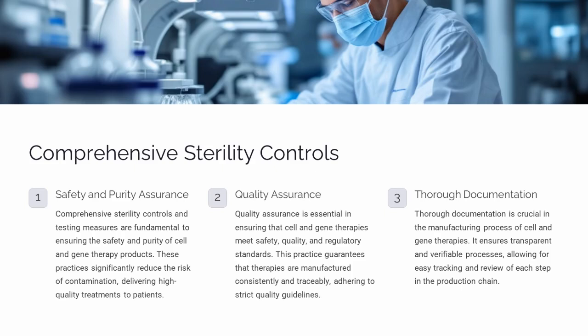Comprehensive sterility controls include safety and purity assurance, quality assurance, and thorough documentation. These practices ensure that cell and gene therapies meet the highest standards of safety, quality, and regulatory compliance.